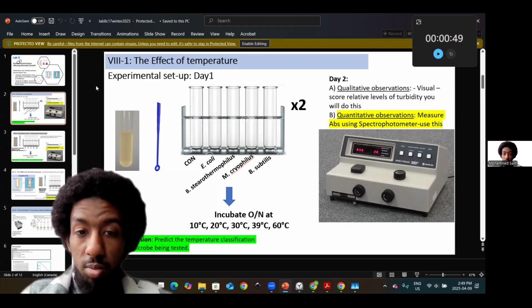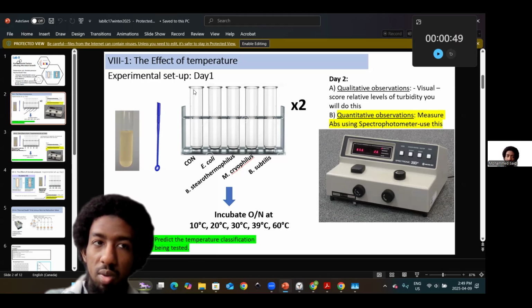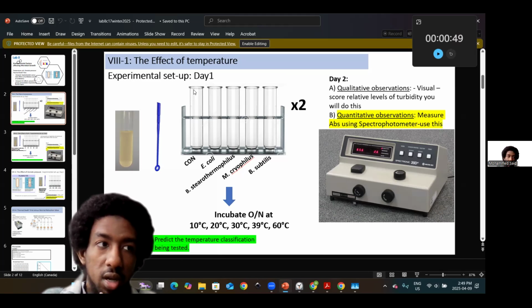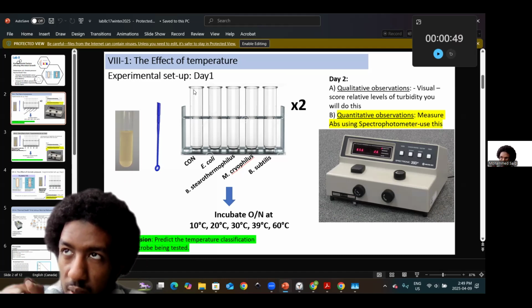And in our case, multiple bacteria per group in the case of temperature. So think about it like this. Bacteria are able to grow, right? We learned about generation time, proliferation, repair mechanisms. We learned about differential staining techniques, spread plating, streak plating, viable counts, plaque counts, etc. So think about those components and think about the life of the bacteria.